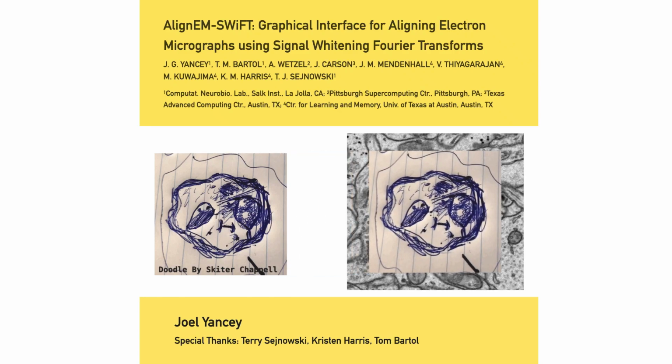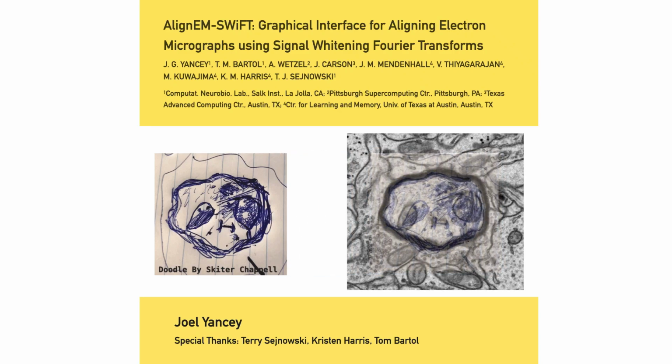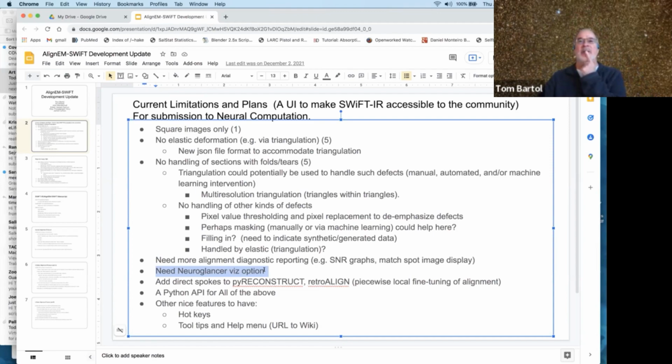tool. And so to address this, we've examined several different technologies, and I think we've settled on the NeuroGlancer. Last week and the week before, we gave some updates on what that looks like, and we're making further progress toward that. Joel and I, and Art, we all feel like it's ready to now start. We're satisfied with what we're seeing, and we're understanding more about how it works. So we're feeling confident and satisfied with it.